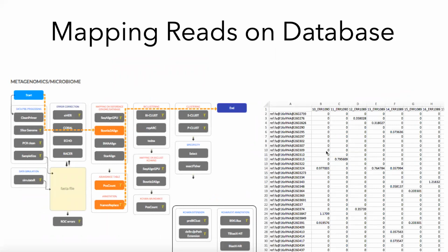You can see that the table of abundance from metagenomic studies, as opposed to, let's say, gene expression studies, has a lot of zeros. In terms of data, this is called sparse data. It has a lot of zero information, zero-inflated data. And by looking at the different levels of taxonomy for these bacterial species, you can then infer differences. So that is a good starting point for anyone interested in metagenomics.